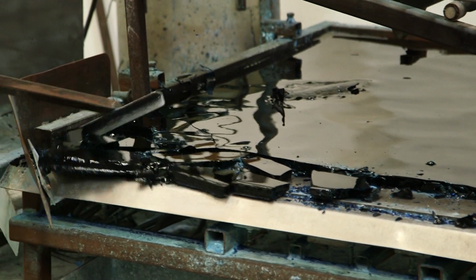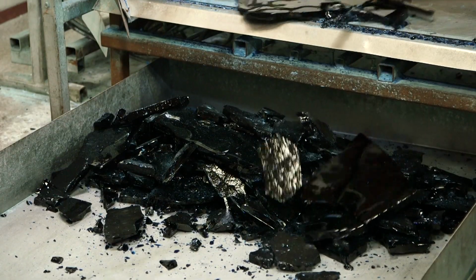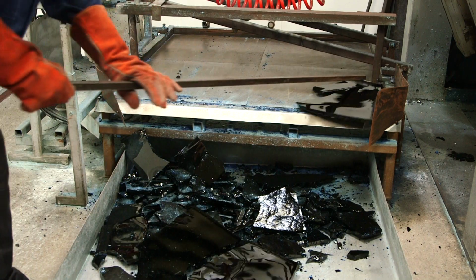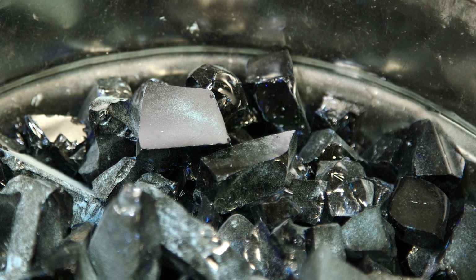During this melting process, the phosphate chains interact with the trace element cations, resulting in our unique ionic copper and ionic cobalt formulation. As the glass is not annealed at this stage, it is broken into smaller pieces and weighed into drums for transfer to the next stage of the process in the sintering plant.